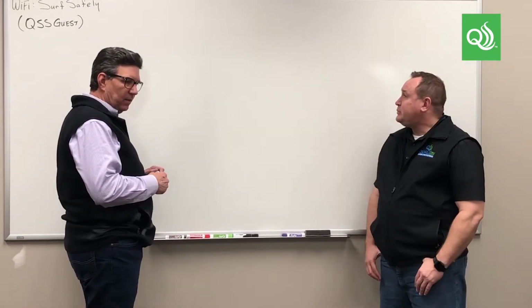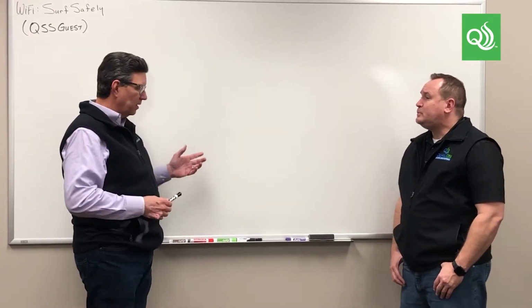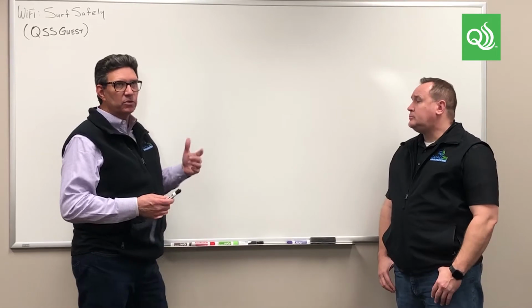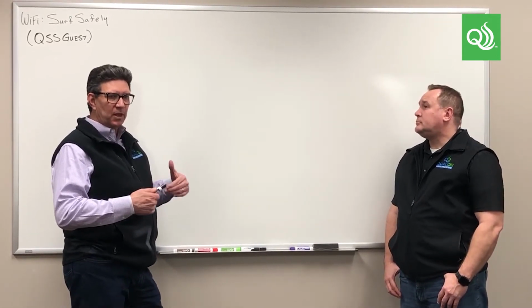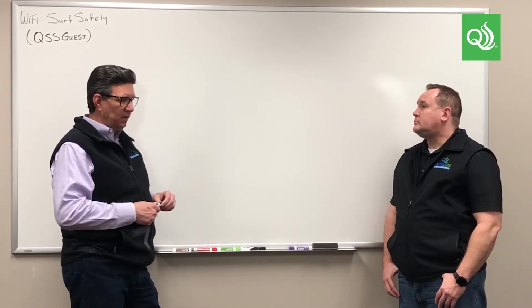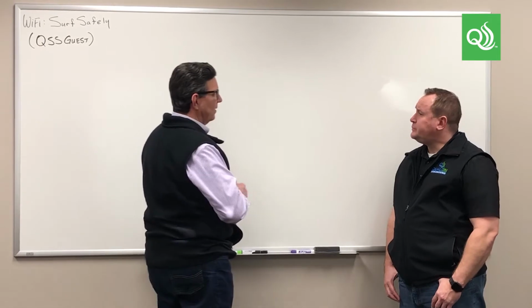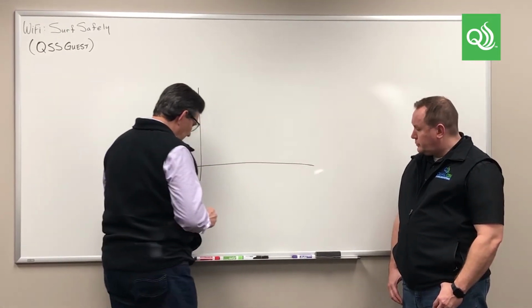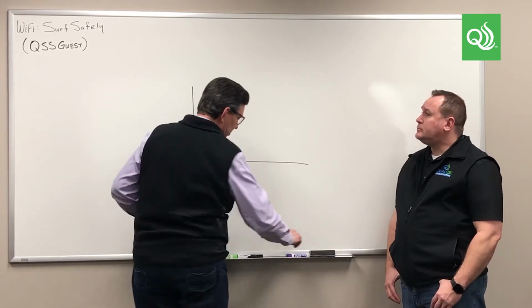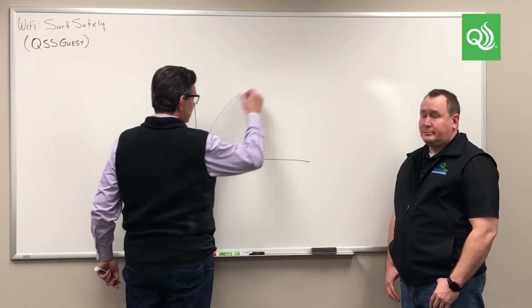All right, so when I was first introduced to the QualiTru system a number of years ago, I saw this idea of using a pump and a bag to develop a sample of what's in your process line is pretty unique, and I kind of liked it. But really, there's a math reason behind this. And so what I'll do is I like using whiteboards. I like graphing stuff because I'm an engineer and pictures do well with us.